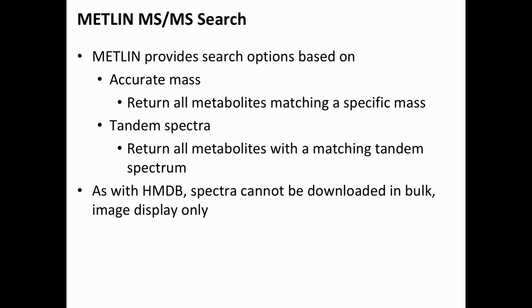So a much better way is to provide information on the structure, because the composition is all you can get from the accurate mass. If you want to know what substructures are contained in there, then you need to fragment the thing. Now, you can't control fragmentation in a meaningful way. You can modulate the collision energy and get different types of spectra, but ultimately the molecule is going to break in the way it wants to break, and you have to deal with that.